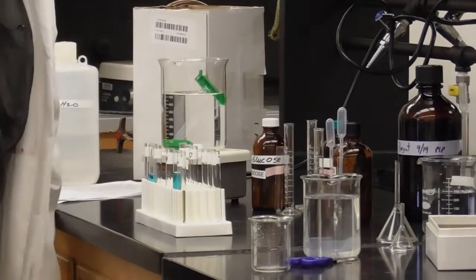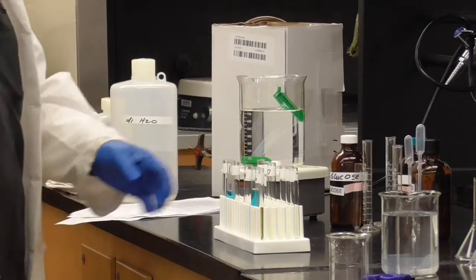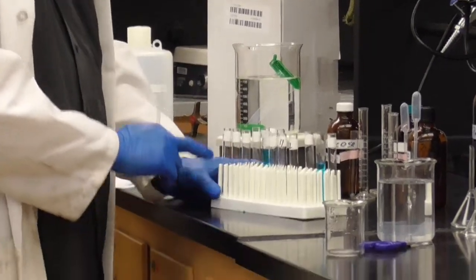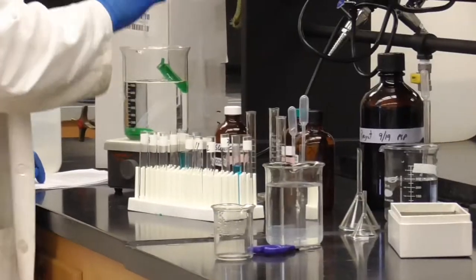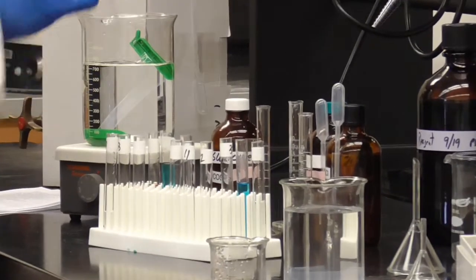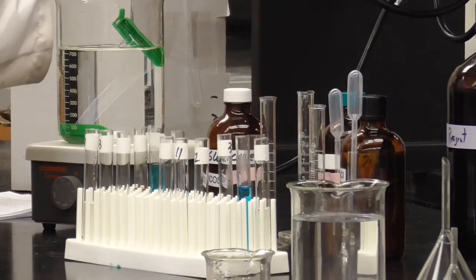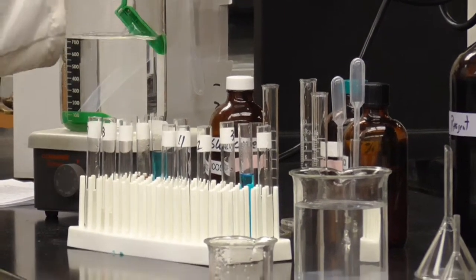Okay, it's been another 15 minutes. Our dialysis has been going. We'll sample it one more time. This was after 0, this was after 15 minutes. So our next set over here, 7, 8, and 9, after 30 minutes. We'll go ahead and get our 3 milliliters out of the water from the outside in each tube.